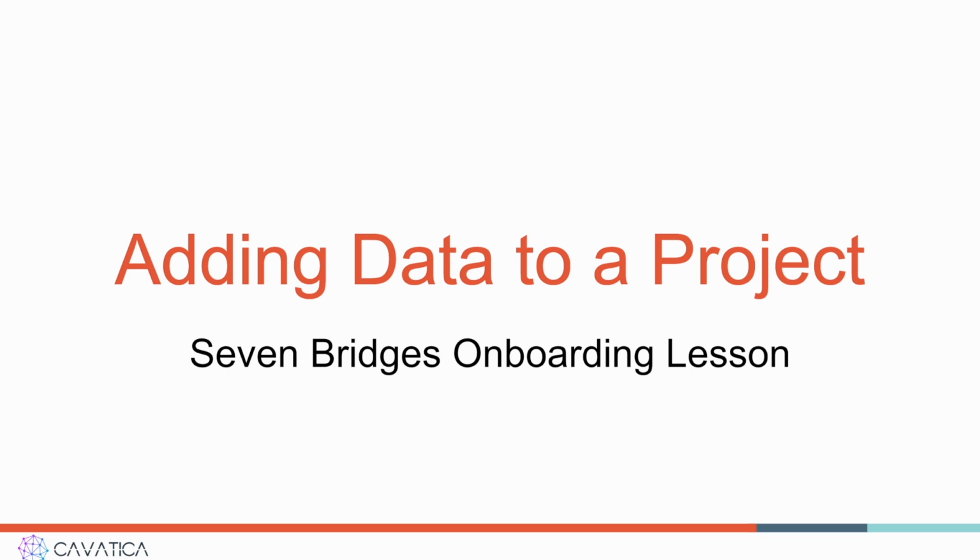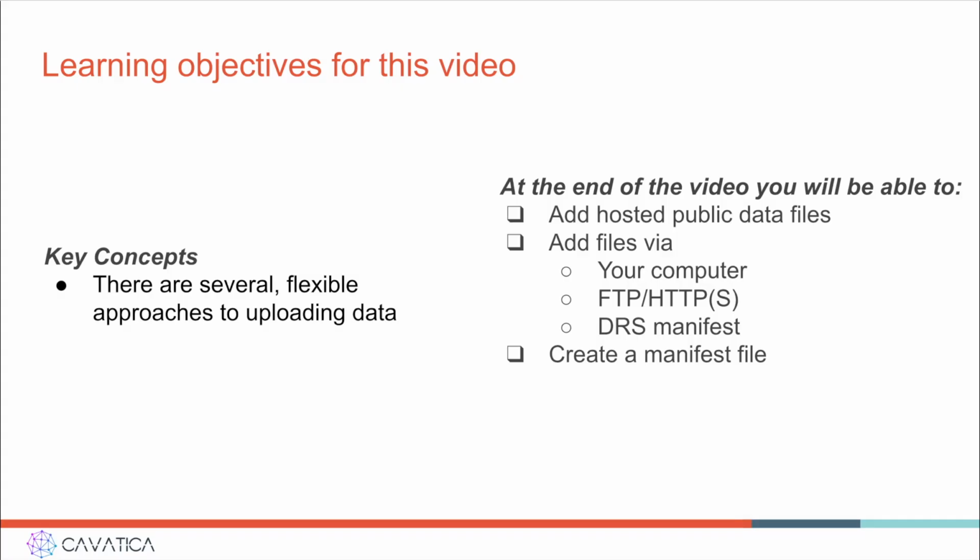Hello, and welcome to the fifth video in the 7 Bridges onboarding lesson video series for CAVATICA. This video is about adding data to a project.